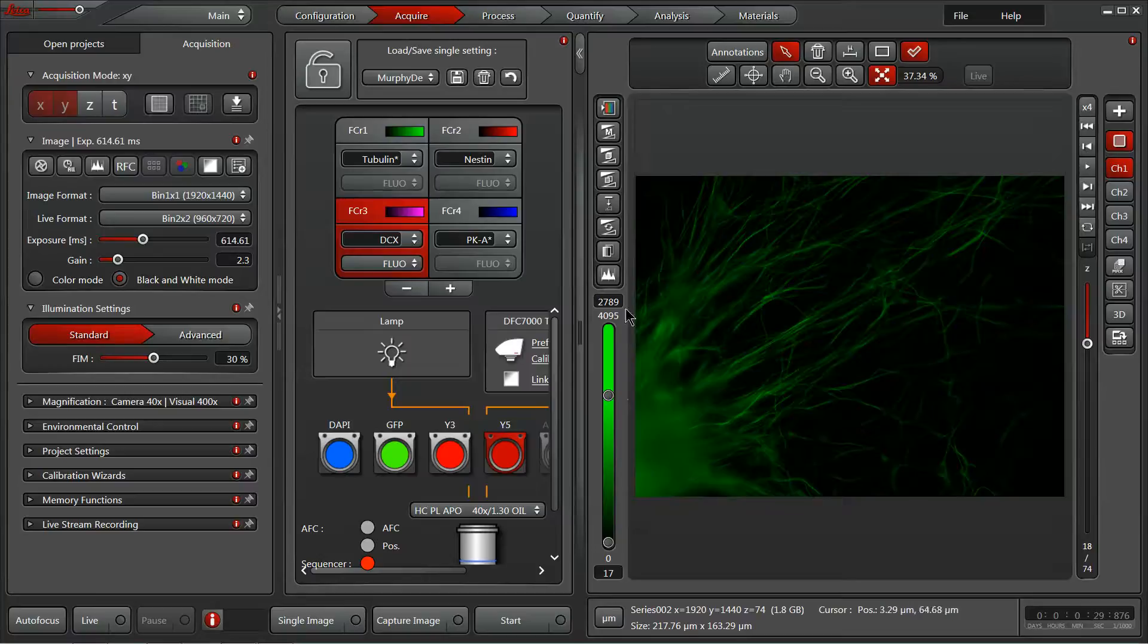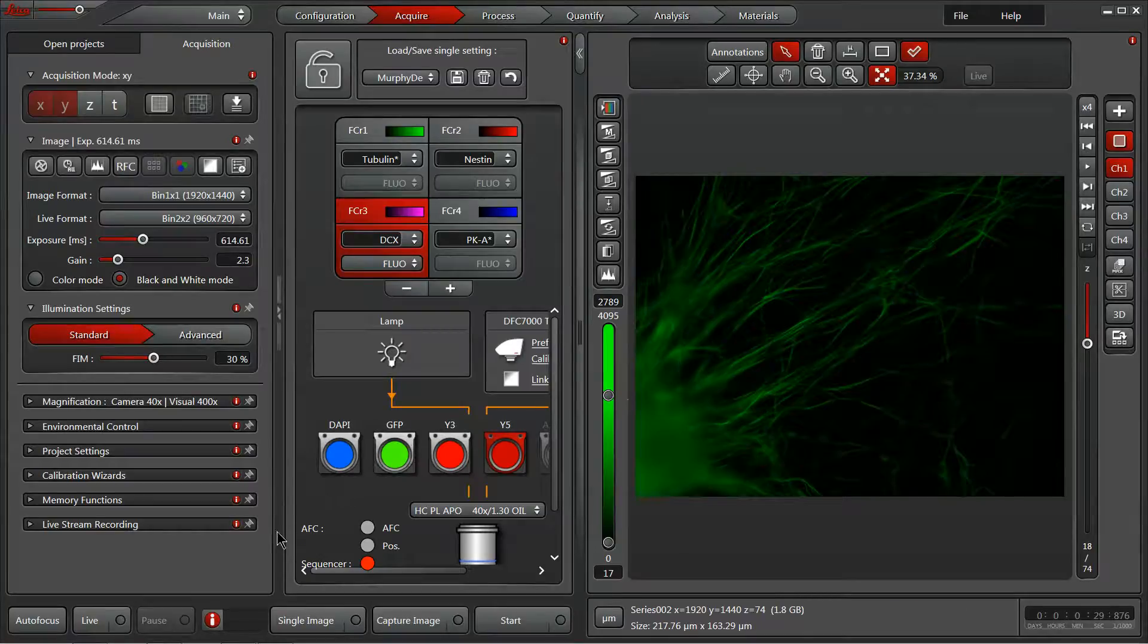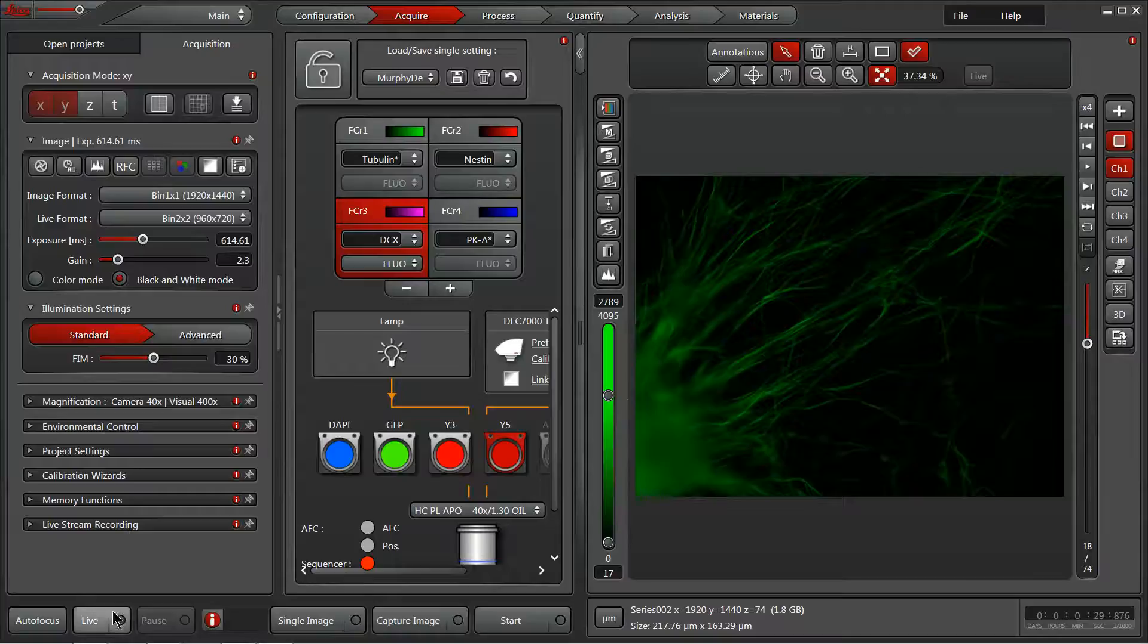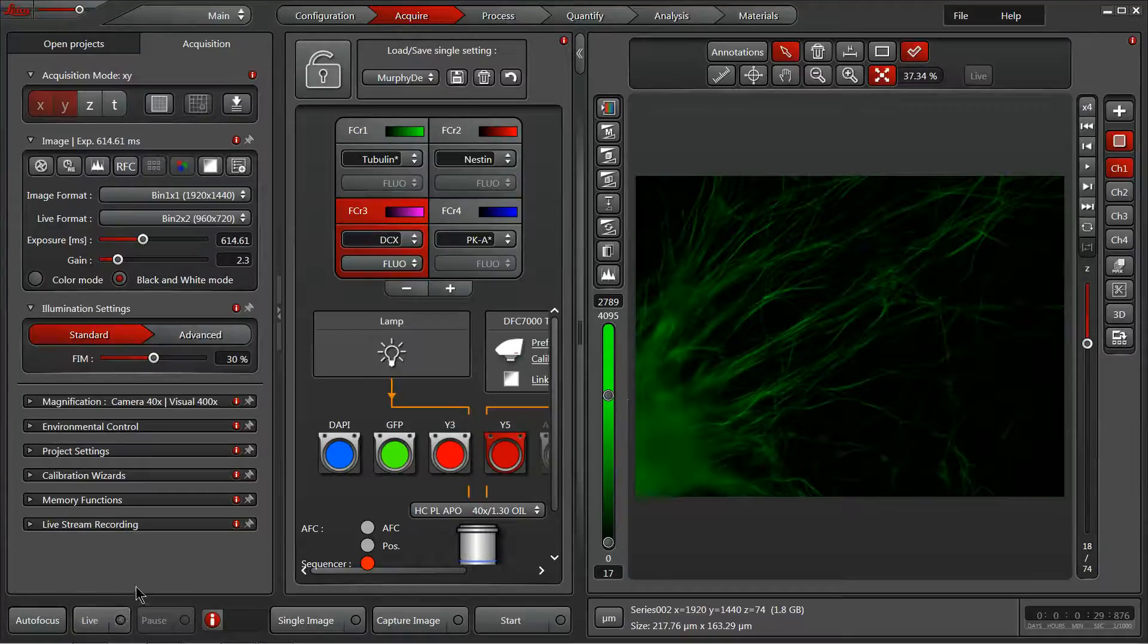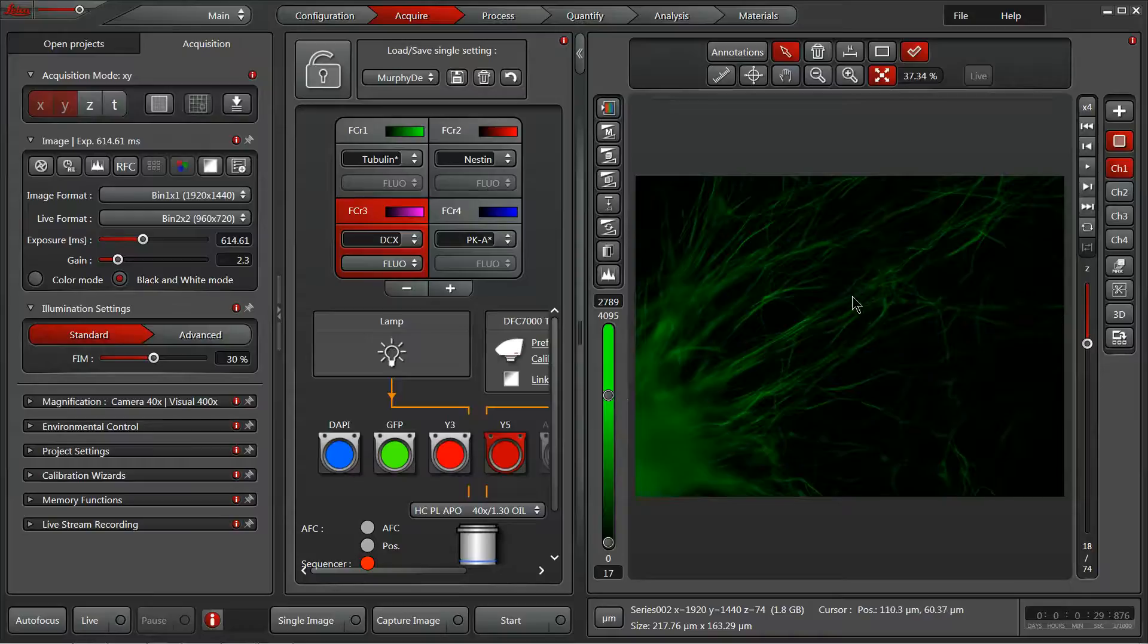Now let's have a look at the buttons across the bottom of our Acquire tab. We've got a live button which will begin the live feed from the camera and display it here in our image display panel on the right.